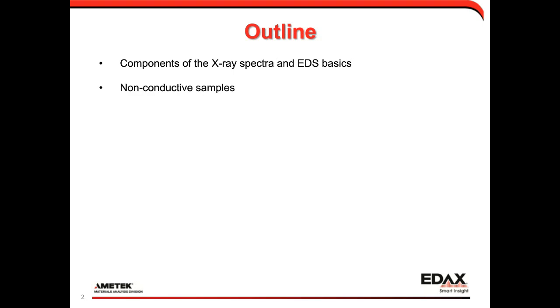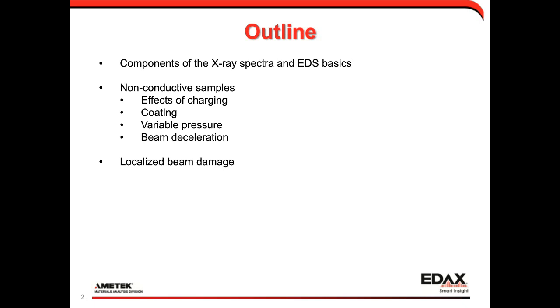We'll start with the basics, then look at the most common problem: non-conductive samples — examining the effects of charging and what we can do about it, including coating, variable pressure, and beam deceleration mode. Then we'll look at actually damaging samples, with two examples: common table salt (sodium chloride) and a sample containing bacteria. We'll cover damage mechanisms, scan strategies for mapping beam-sensitive samples, and finally summarize everything.